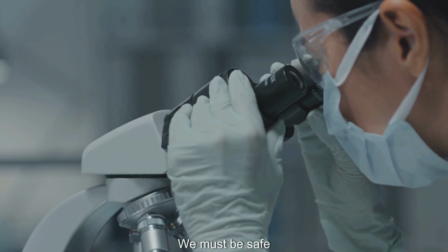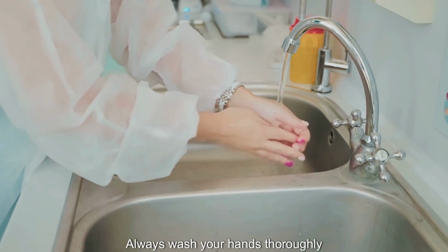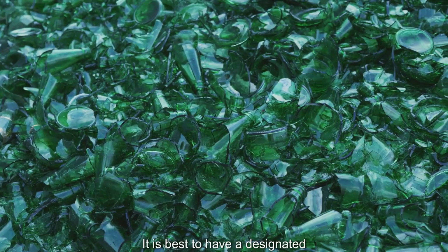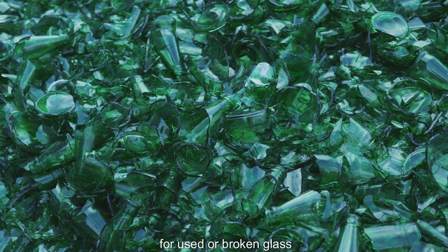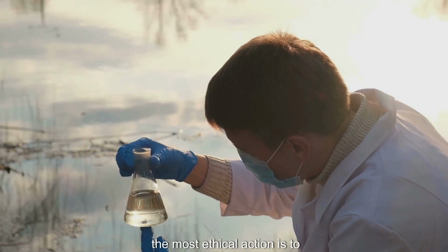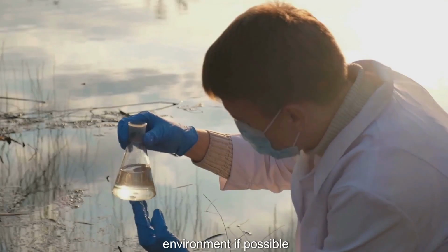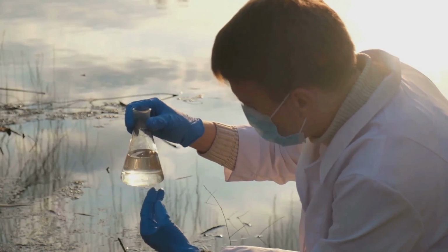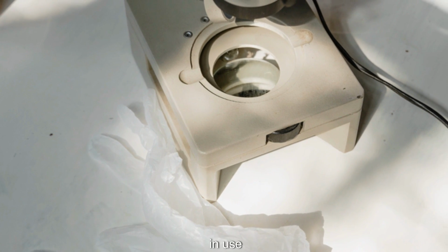We must be safe, clean, and respectful in our work. Always wash your hands thoroughly before and after you use your microscope. It is best to have a designated small, sturdy container, like a plastic tub, for used or broken glass. After you are done observing, the most ethical action is to return them to their original environment if possible. This shows respect for the life you have been privileged to witness. Always cover your microscope with its dust cover when it is not in use.